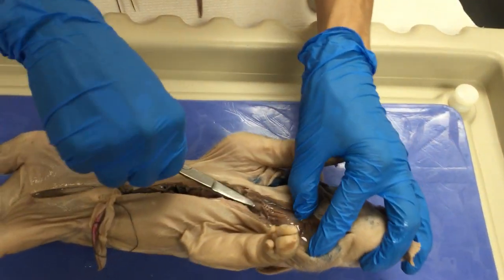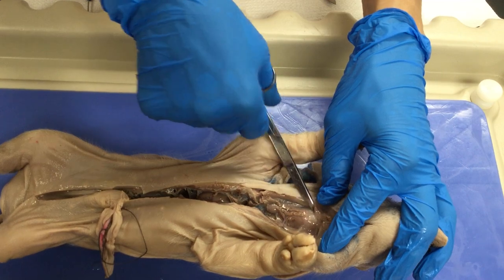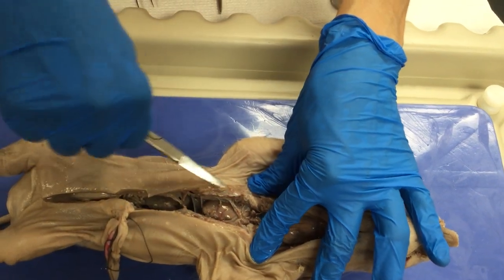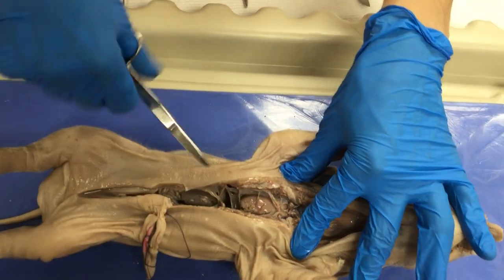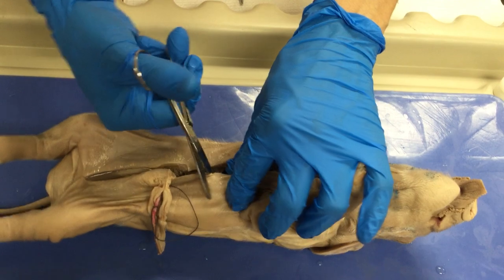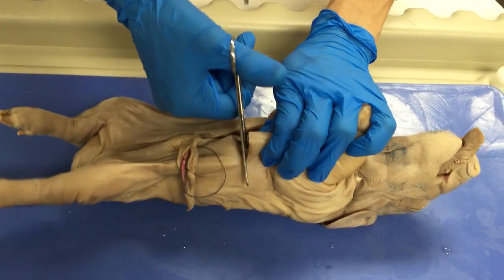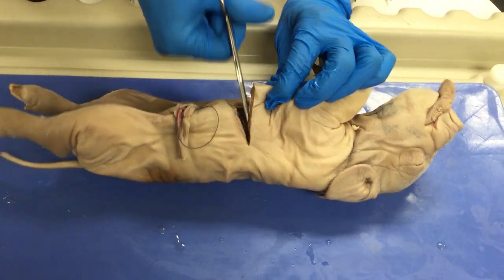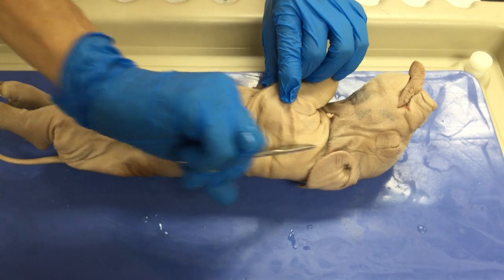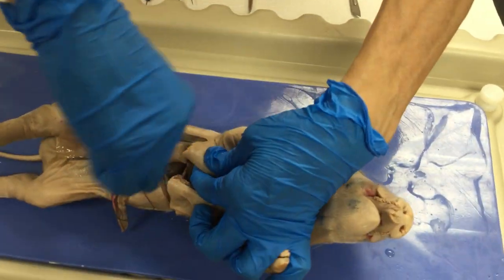Here you can see the trachea and its muscles at the top. This cartilage here is the thyroid cartilage, and here you can see the heart. Now I'm going to go following the edge, the border between the thoracic and the abdominal cavity, just to the sides — up to the edge of the point of attachment of the arm on both sides, left and right, so you can have plenty of room to open this wall.